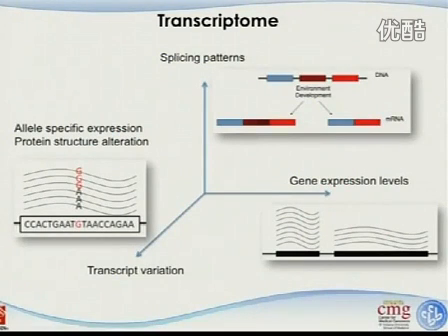But clearly RNA sequencing can do this to a certain extent better, because you really intrinsically look for not only the expression levels of different genes, but also the sequences. Just to show the idea with one example: the reference genome in this location is a G. In your final product, you see half G, half A, and you will know there's a heterozygous variation in that region. So those are things that an array cannot do, but RNA sequencing can do.